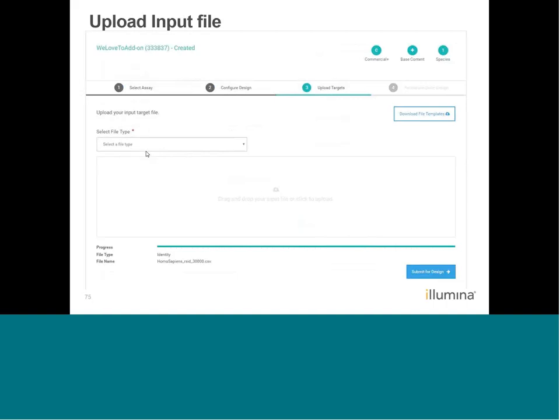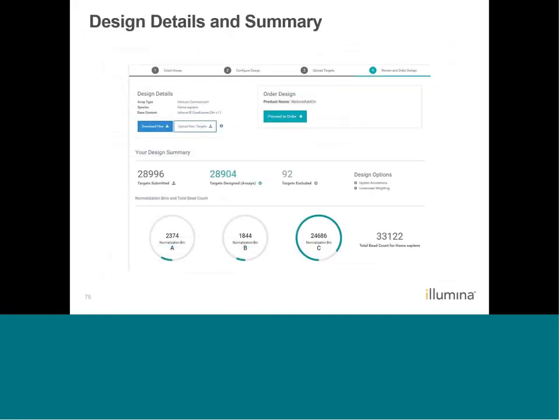But we now reviewed that file, and we are going to upload a modification of that file. If you remember, I said you can't do multiple iterations for Commercial Plus. In this case, when we upload a file, it's going to replace the previous file. So we can't do multiple files for Commercial Plus. There needs to be just one additional file added, and that's your add-on content.